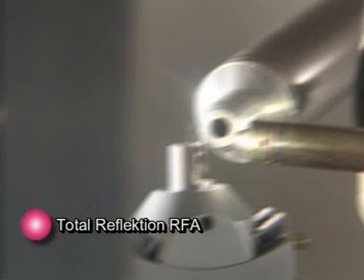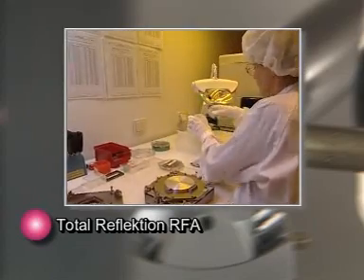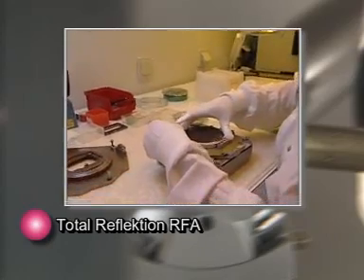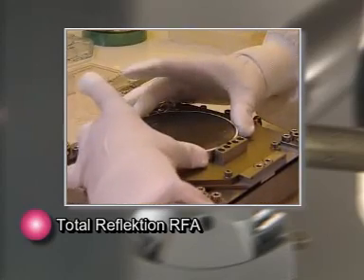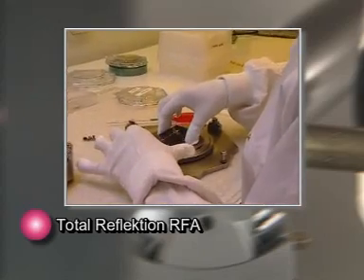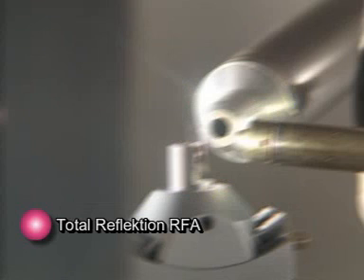Extremely high sensitivities of detection are required also in semiconductor production. For selective examination of semiconductor surfaces for minute traces of impurities, the fluorescence measurement station in ANKA can be made to let the X radiation impinge on the sample under a very flat angle of incidence. Changing the angle of incidence also allows analyses to be conducted with depth resolution. In this way, a wide variety of samples can be characterized.